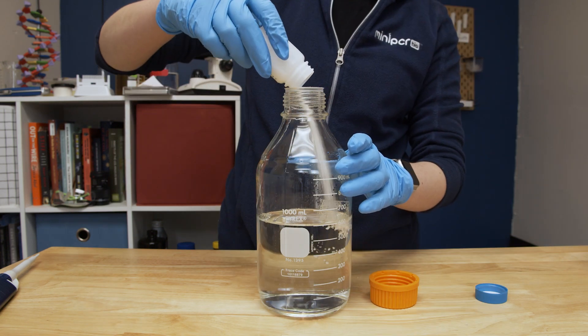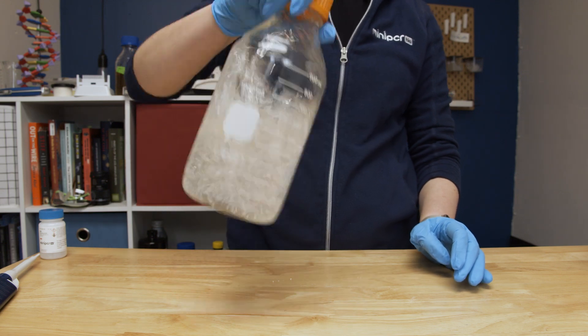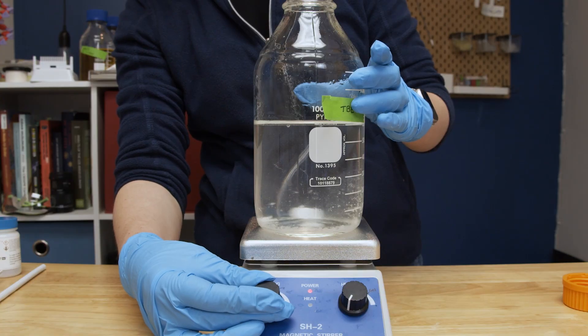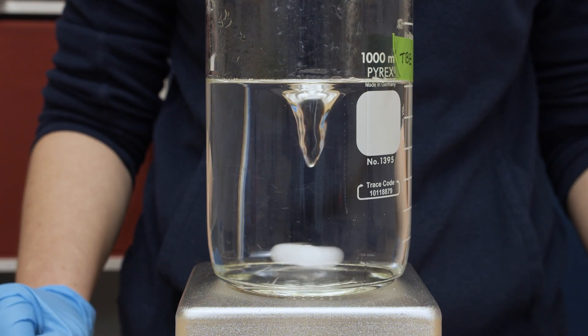Combine the TBE buffer powder with distilled water and mix until dissolved. It can take up to 15 minutes for the powder to dissolve, but you can stir or gently heat the solution to help it dissolve more quickly. TBE buffer can be stored at room temperature for at least three months when stored in a closed container.